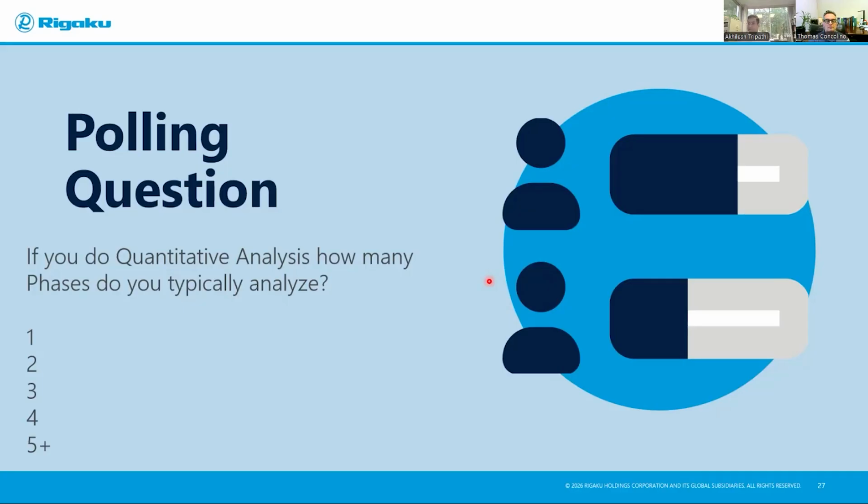So as long as your material is inorganic, mineral, clays, cements, there is no difference between the two. But if you are using organic material, which is carbon, hydrogen, nitrogen, oxygen, or just graphite carbons, which is a low Z material, you should always be careful not to use the shallow one. There are two types, for example, from Rigaku, a 0.5 millimeter or a 2 millimeter. Use the deeper well one, so that the X-ray does not penetrate and reach the bottom.